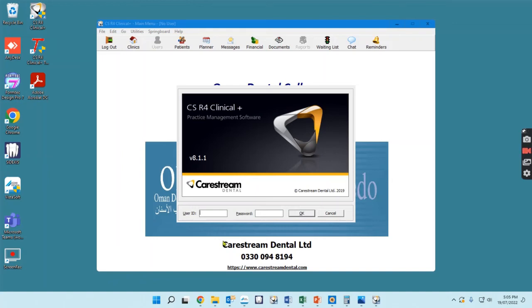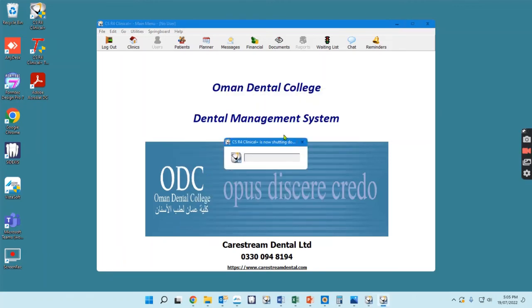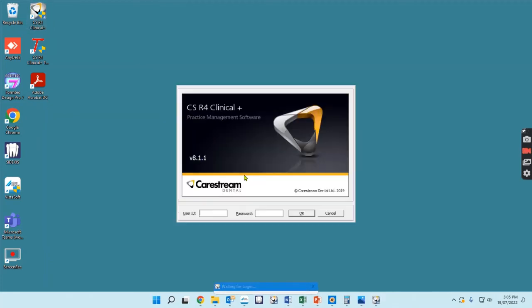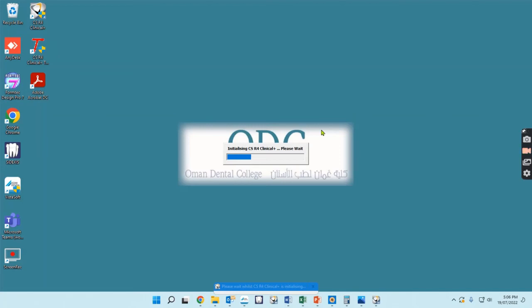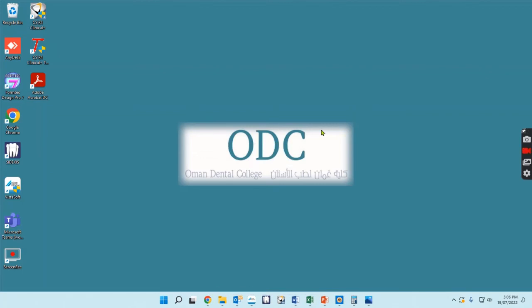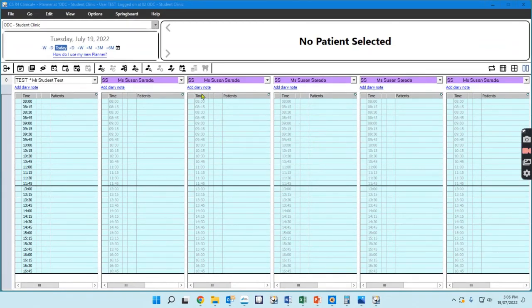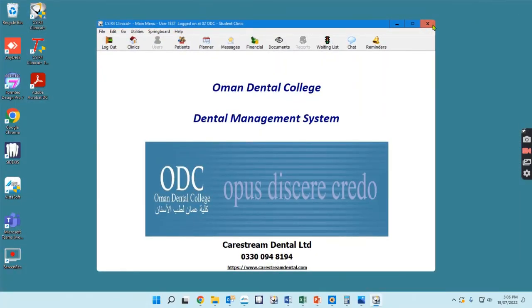So anytime you walk up to a computer and you see this login screen with R4 open behind it, I don't want you to log in. I want you to hit Cancel, and that will close the program. Then you can open the program and log in fresh — this is what you want to see: the login screen without the program sitting behind it. When you're leaving at the end of the day, instead of using the Log Out button, just close the program by clicking X in the upper right to close the planner, and then X to close the program.